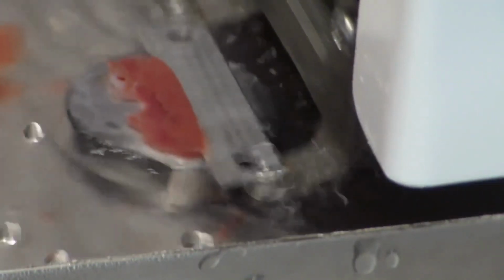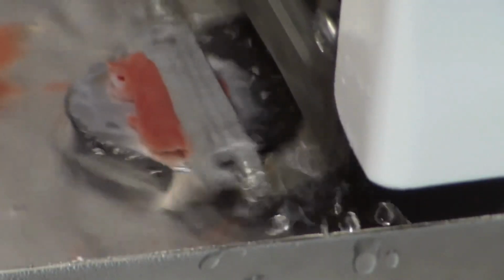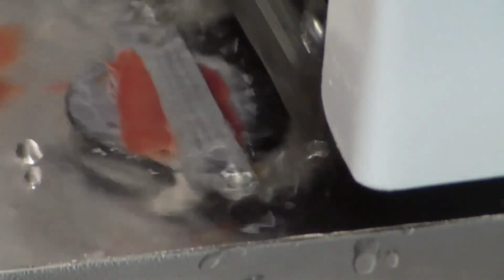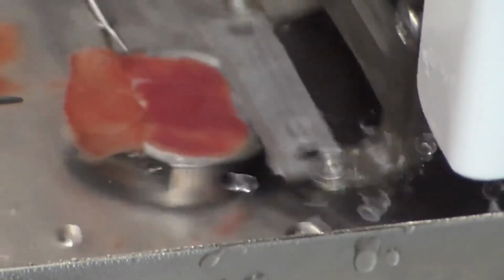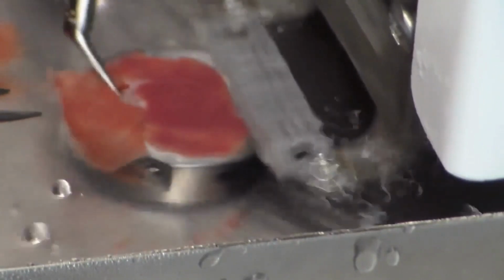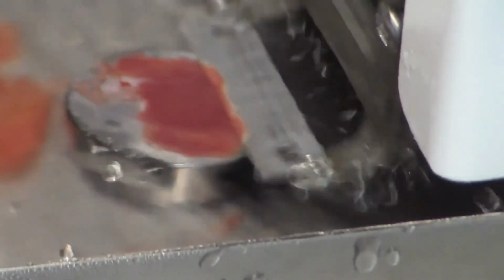In this case, the left ventricle was glued to a metal pedestal that is held in place magnetically. And then the razor blade comes across and creates the cardiac slice. In this case, the cardiac slice is about 200 microns thick. After cutting all the way through, sometimes small threads of the myocardium may still be attached to the remaining LV, and you would just have to cut it away to make your cardiac slices.